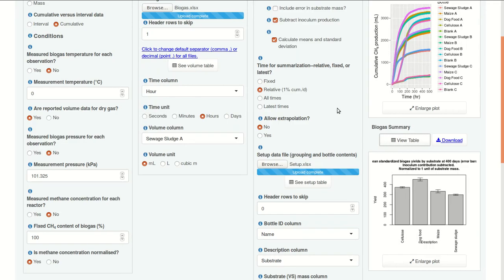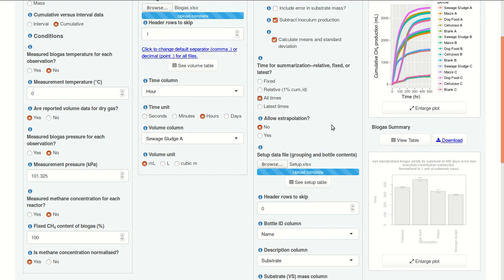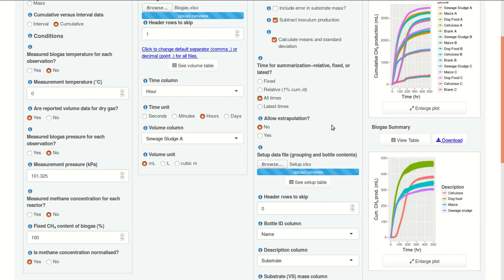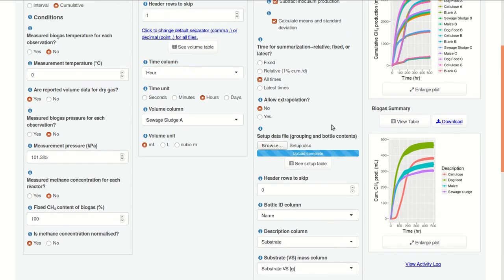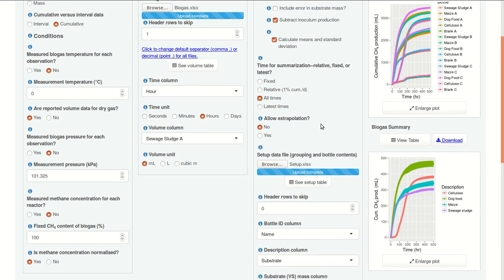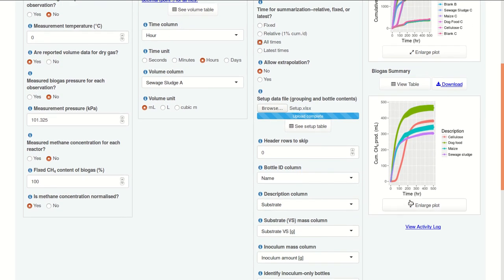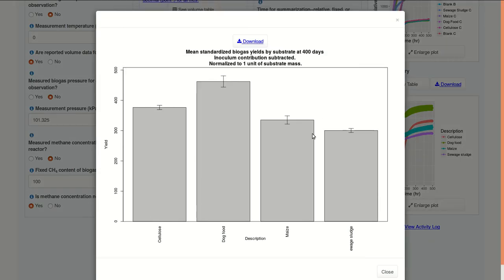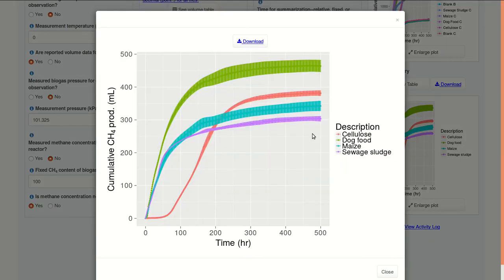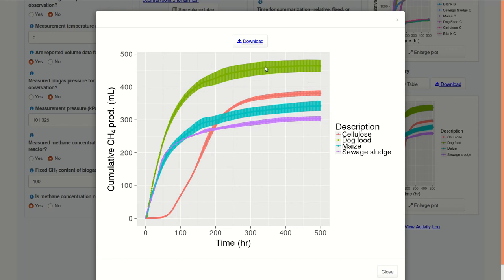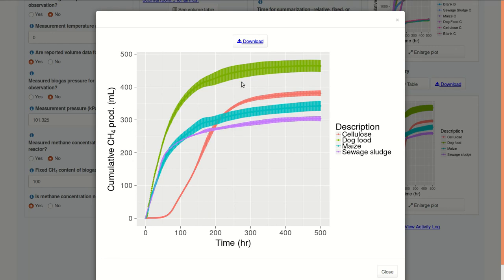Now, we could also use all times. This plot may take a bit to print. Because we're using all times and calculating means and standard deviations, what we see now is a line and points for the mean values. They're so close together here, we can't really see them. And then we have error bars, which just look like filled space here, again, because we have an observation for every hour. They're so close together. But here, we can see the replicates must group pretty well. Standard deviation is not very high. It's highest for dog food. And we can see also the trajectory of each of these substrates.